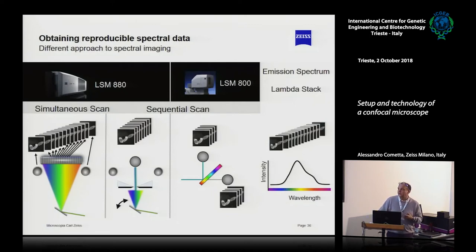Or what you can do is keep in mind that this kind of detection has a very high dynamic range. So the steps you can have in the gray level are very high. Usually we're speaking about 24 bits.